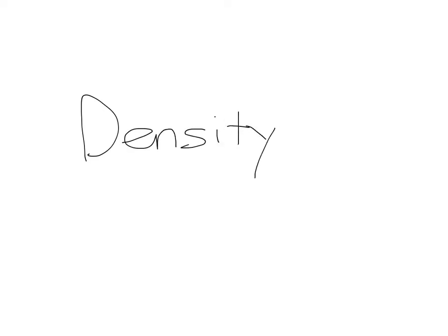Today in class, we did a lab where we determined the density of an unknown solid. Here's the process we went through.